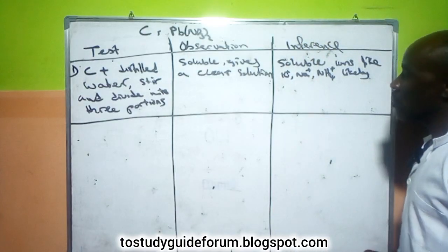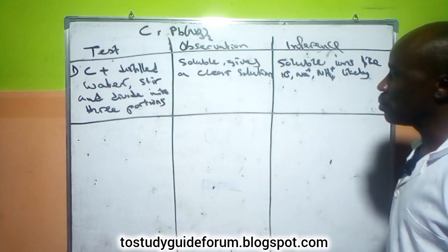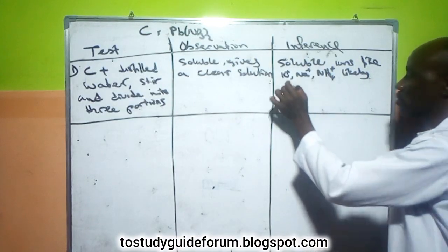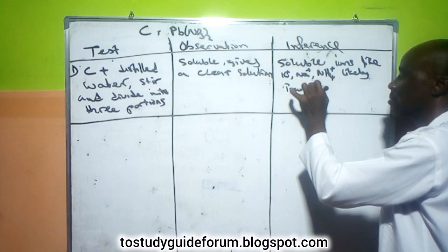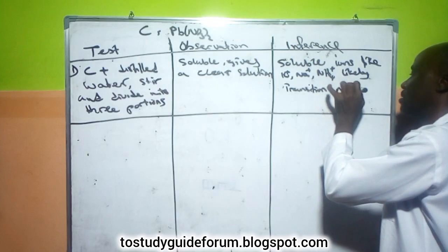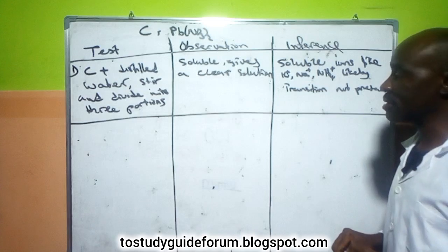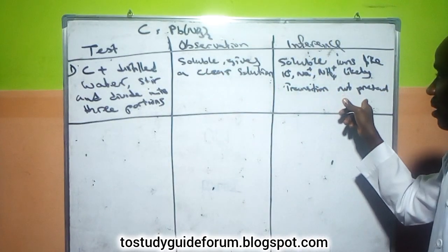The next thing we can put here is that transition ions are absent because of the clear solution. Transition ions are not present.